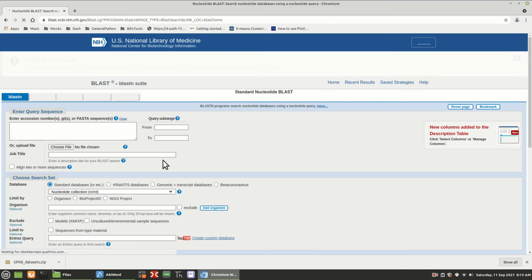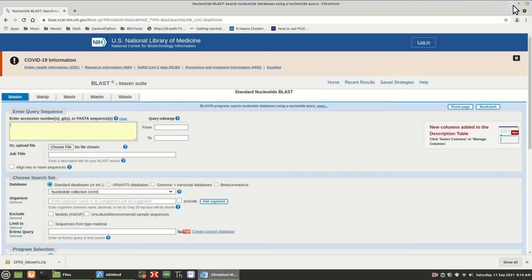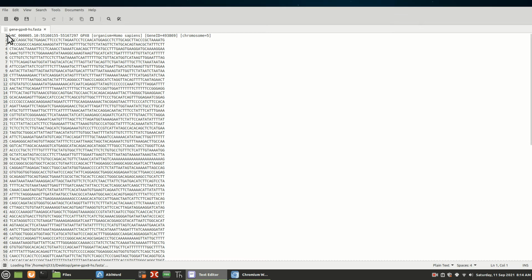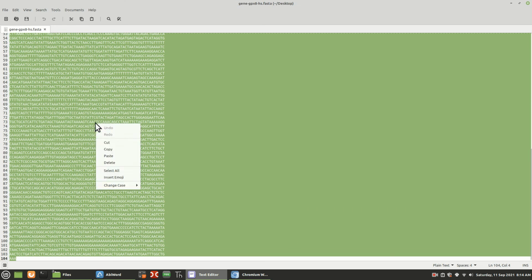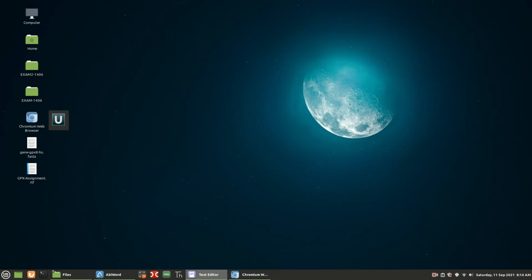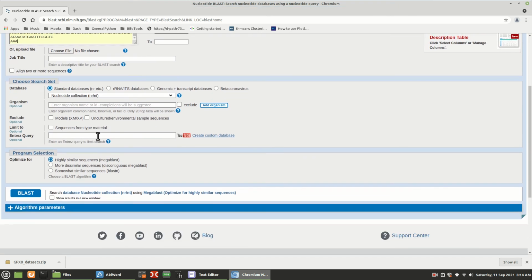Alright, now I'm going to put in the sequence that we just downloaded. Alright, copy, and I'm going to put that into BLAST. Alright, now I'm going to scroll down, and then I'm going to pick organism.